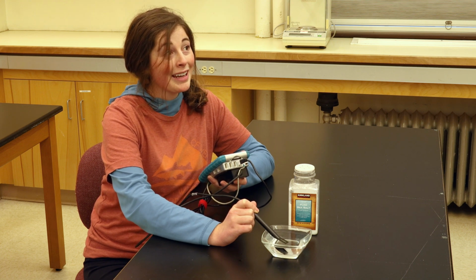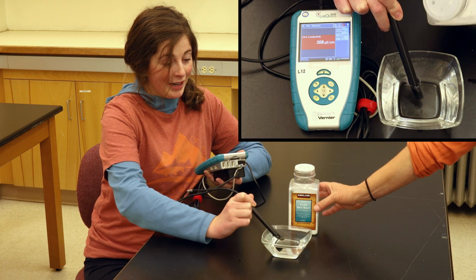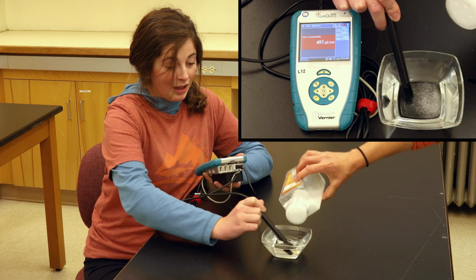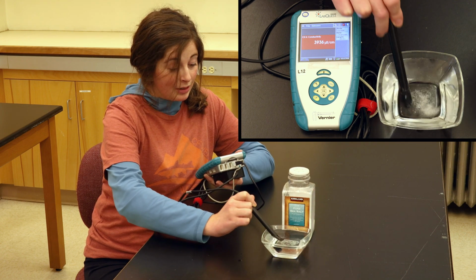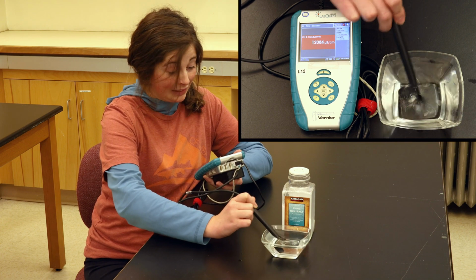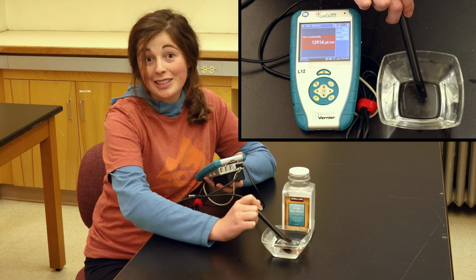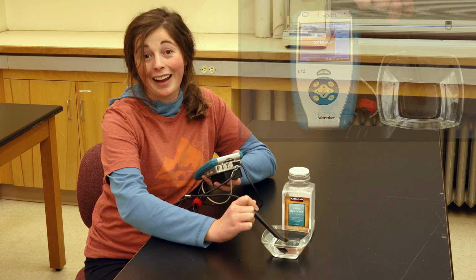Dalit, can you lend a hand and pour the salt for me? Sure. All right. Dalit's going to pour some table salt right in here, and we're going to, wow, right away you guys, the conductivity shot up to about 3,000, 4,000, wow, 8,000. Oh my gosh, we are getting a reading of 12,914 microsiemens per centimeter right now, you guys. That's a really high conductivity.